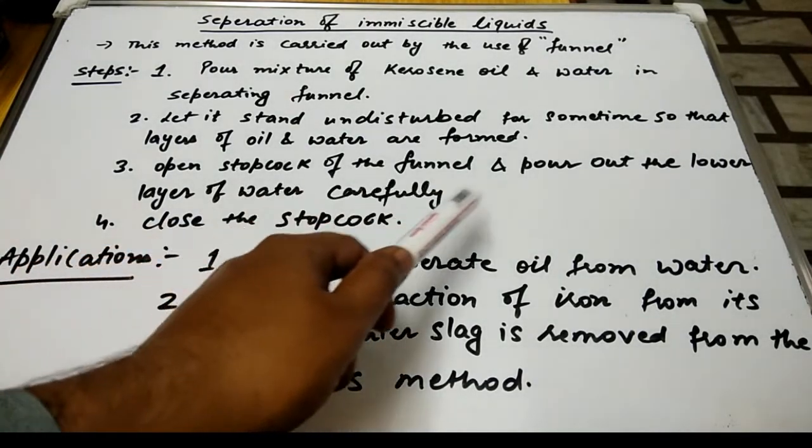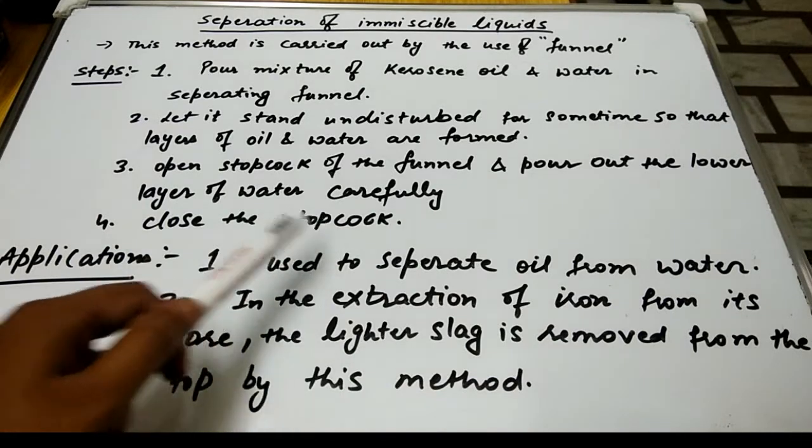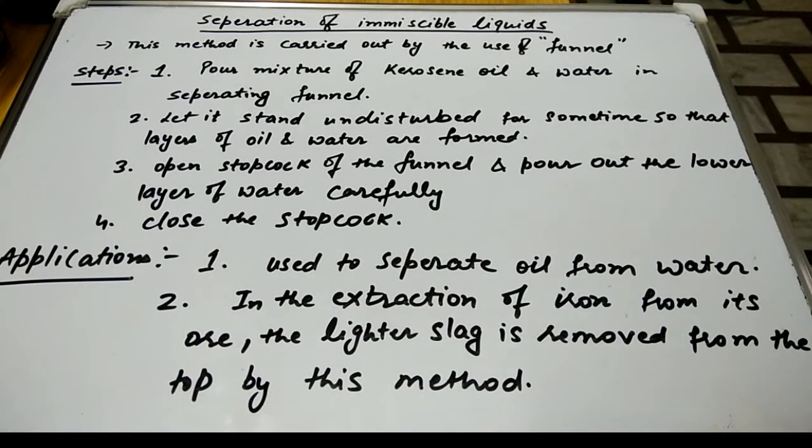Open the stopcock of the funnel and pour out the lower layer of water carefully. Now close the stopcock and the two liquids will be separated out.